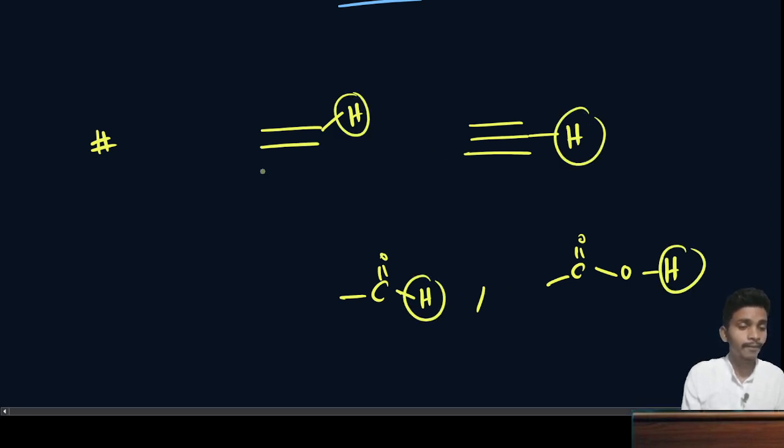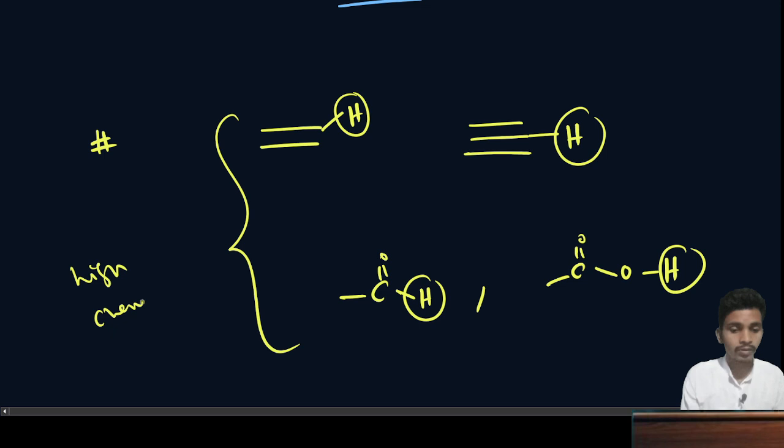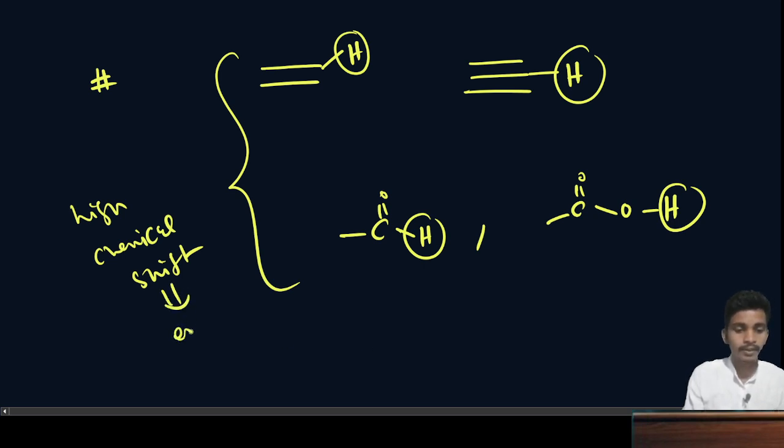So these all have high chemical shift, and that is explained by the anisotropic effect.